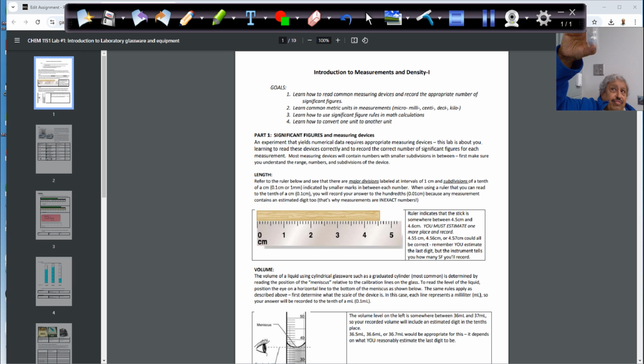So, and then we have to measure using verniers, a tool to measure the diameter. We need what? The diameter. So we have to determine their density. And then I found the density inside the literature, and then we'll make what? Percentage error. This time it is not in the procedure to tell you to do percentage error, but to compare it. But we will be able to compare today this one here.